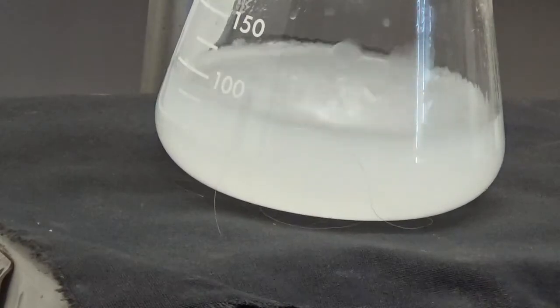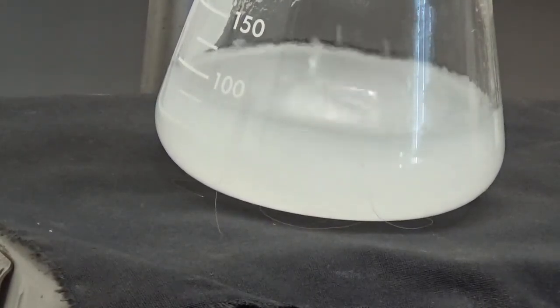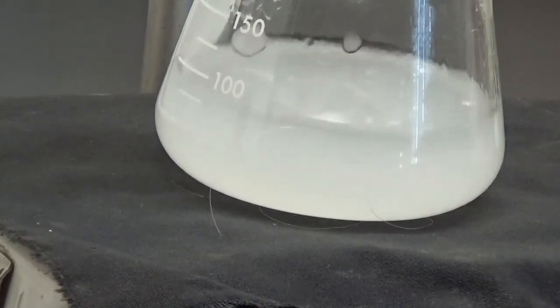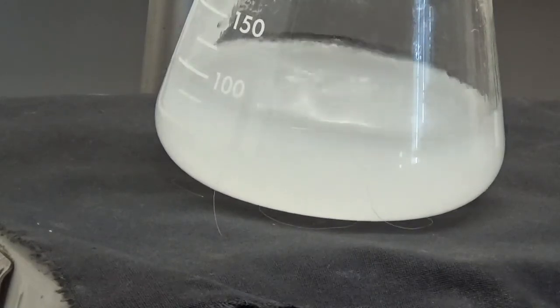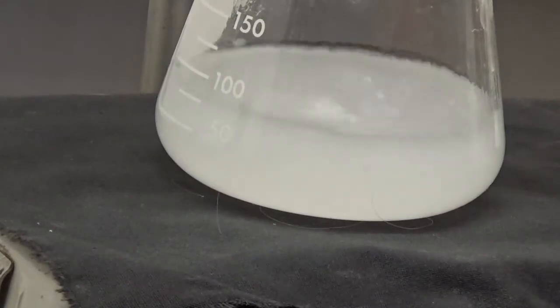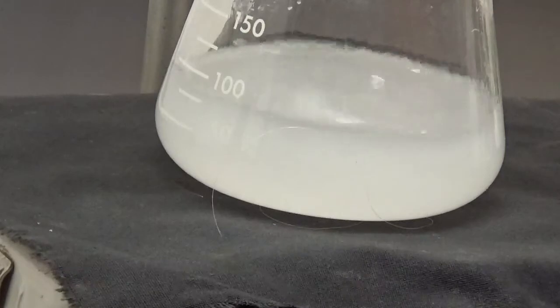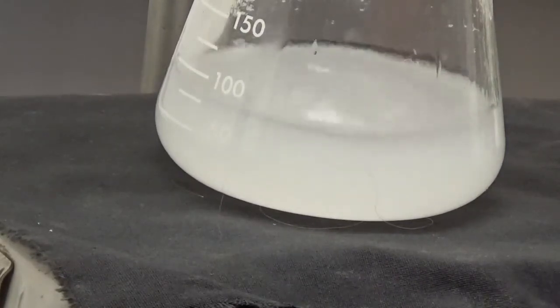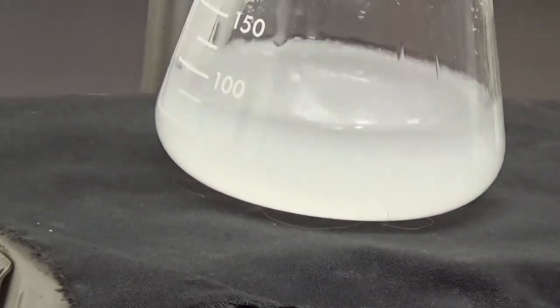I've just added my first 10 milliliter portion of water. Acetic acid now. A bunch at the beginning.